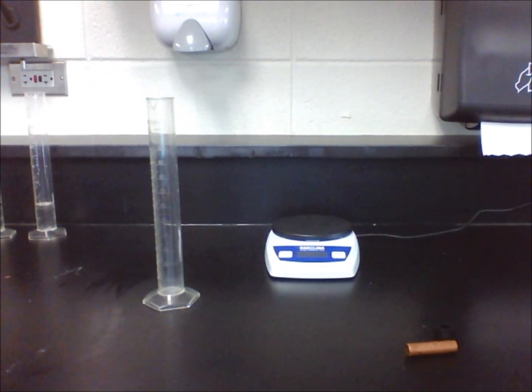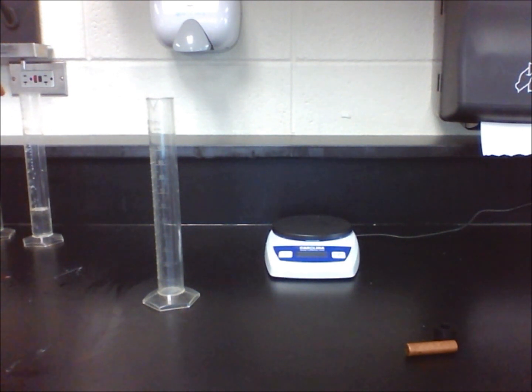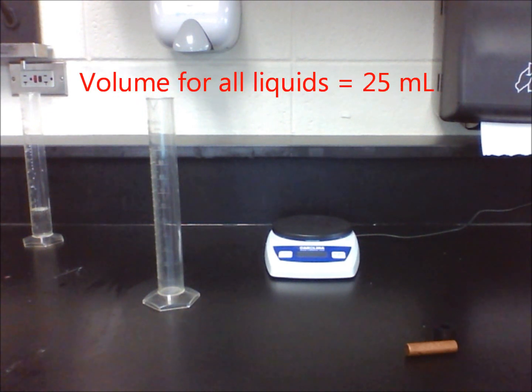In this lab, we will use a procedure from lab 2.1. Let's find the density of three different liquids and predict how they will behave when mixed together. The three liquids we will use are vegetable oil, corn syrup, and water. Since the procedure tells us to use 25 milliliters of each liquid, we have our volume.